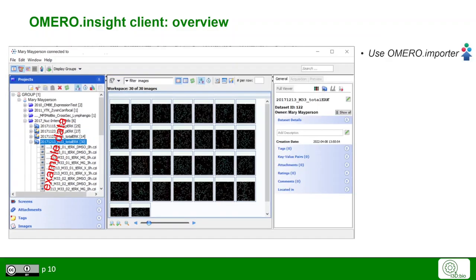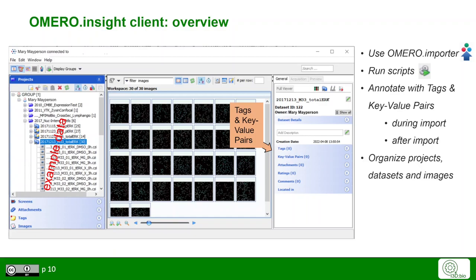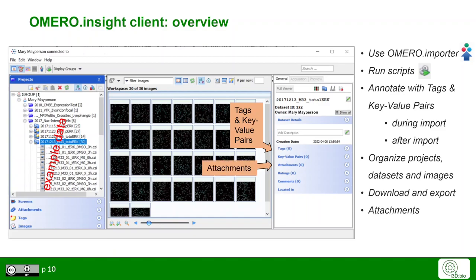You can use the Omero Insight client to use the Omero importer for uploading data into Omero, to run scripts, to annotate with tags and key value pairs either during the import or after the import in Omero Insight. You can organize your projects, datasets and images, and you can download and export images. You can also make attachments, ratings and comments and you can visualize your data.